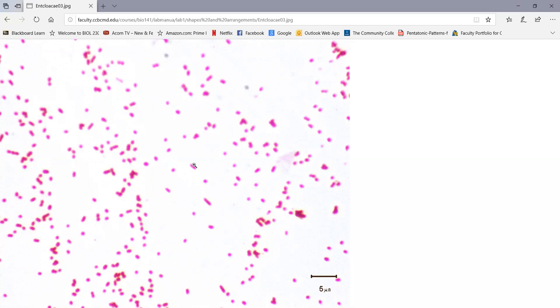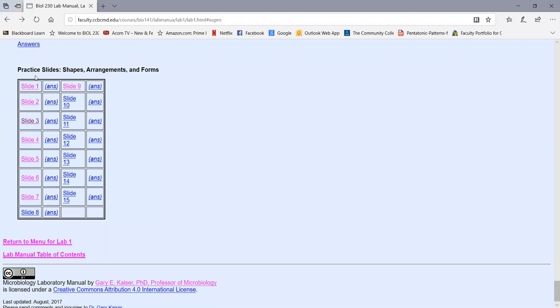But if we take a look there, we see a bunch of hot dogs. That's a bacillus, that's a bacillus, that's a bacillus. So as long as we see true bacillus shapes there, we know that the rest are dividing bacilli. So always look carefully for the little hot dogs before you call anything a diplococcus or coccus. And here's a more typical bacillus that's not as actively dividing. So we see some of them in the process of dividing, but most of these look like little hot dogs.